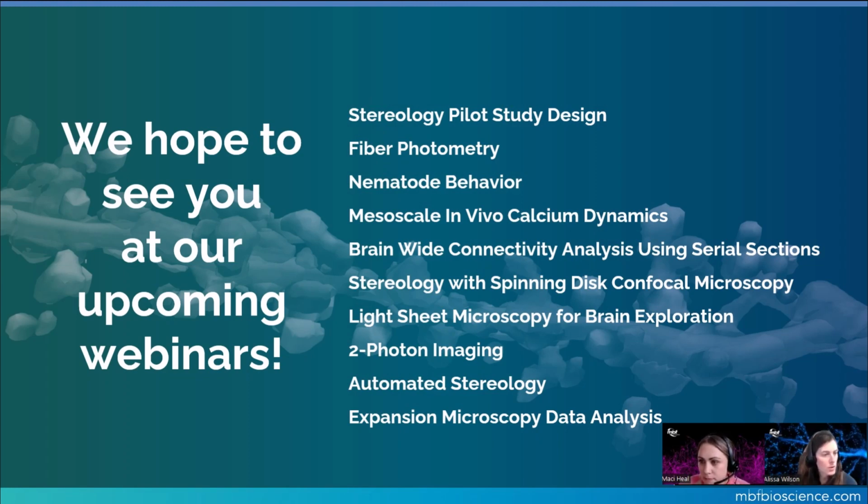And there was also a question about the tree tracing mode, and if it's possible to decrease the distance between the beads of the trace. So in automatic, when you are setting up your settings, there is a seeds tab, and you can make that. There are 3 options, radio buttons, that can make them more packed or more dense or more sparse. And so yes, you are able to do that when setting up your trace, that automatic tracing.